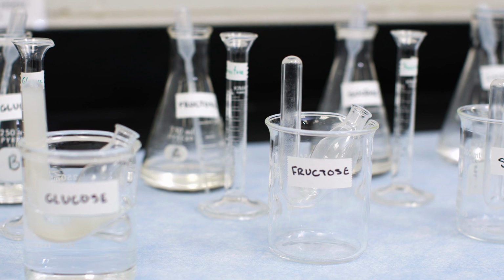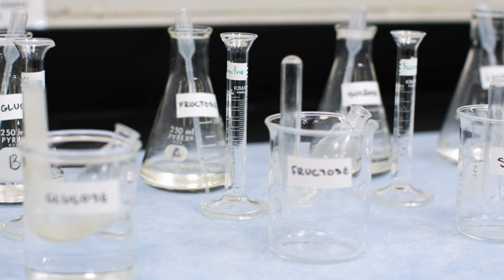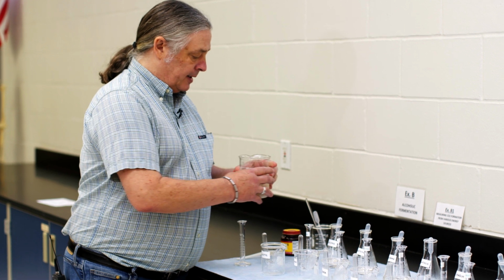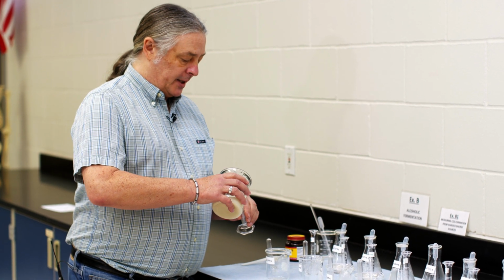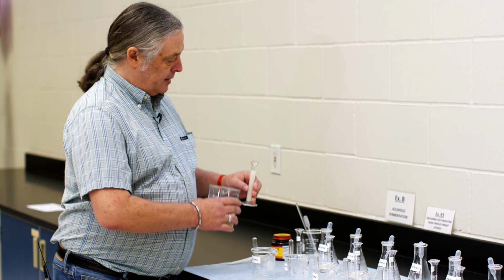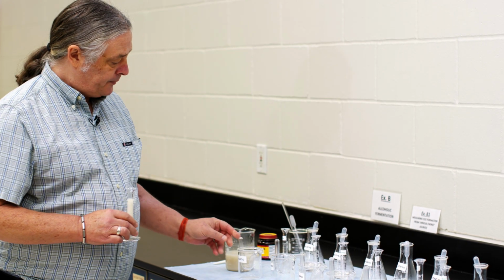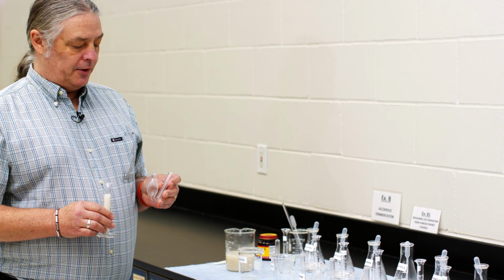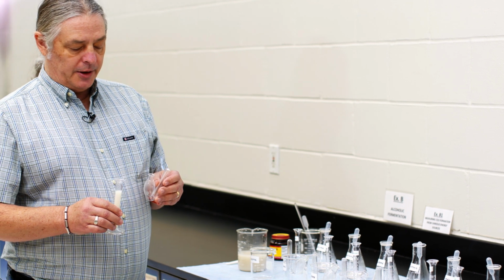In our textbook examples, they were using glucose as the example molecule, but maybe they can use other molecules as well. So we have a setup here of different solutions with different organic molecules for the yeast to potentially try to use for fermentation. And what we're going to do is take a little bit of yeast, about 10 milliliters, measured in the graduated cylinder, and we're going to use what are called fermentation tubes, which makes sense if we're going to be looking for fermentation, to do the experiment with.